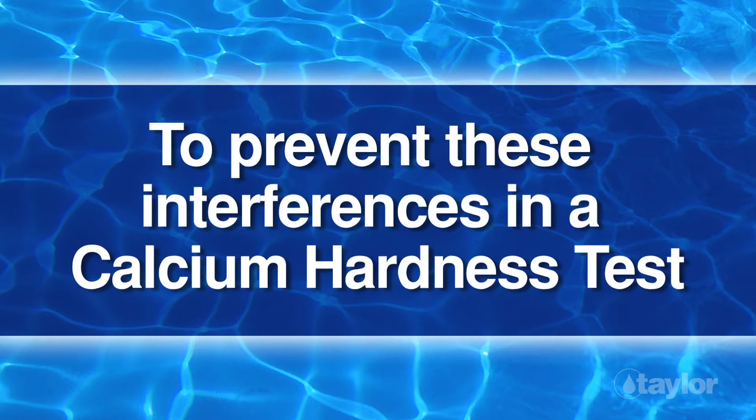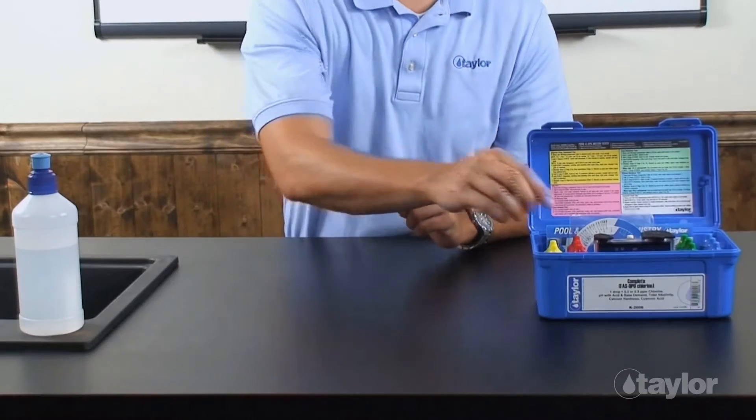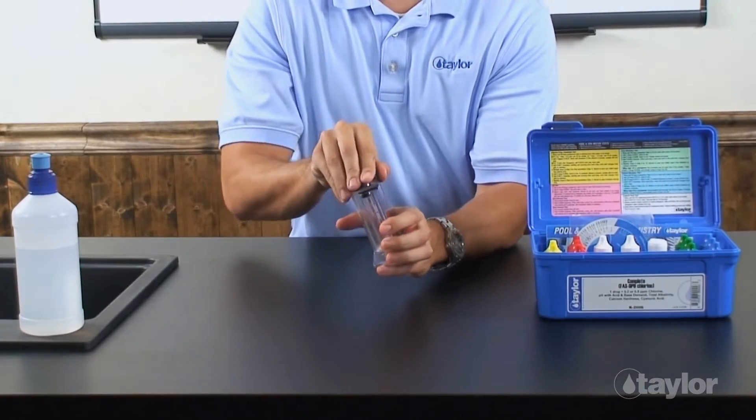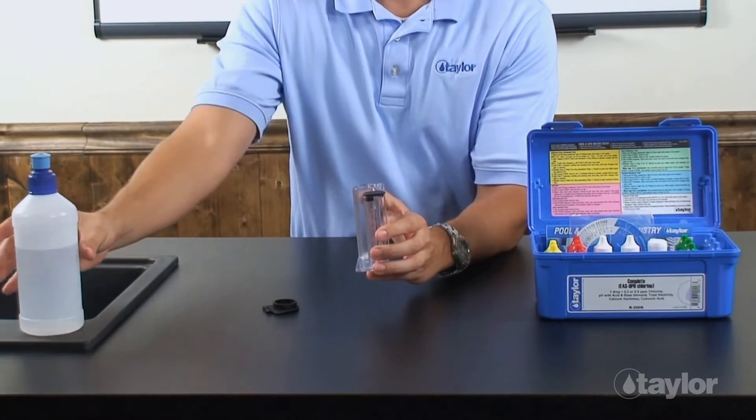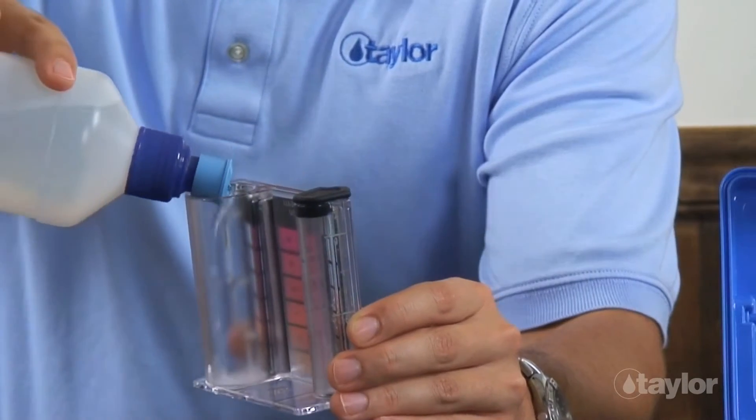To prevent these interferences in a calcium hardness test, add additional reagent 12 at the beginning of the test. Rinse and fill the large comparator tube to the 25 ml mark with the water to be tested.